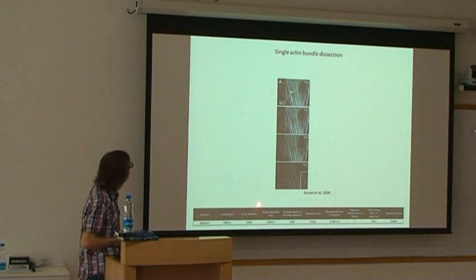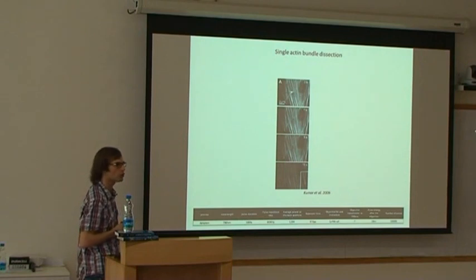And this, all the other. Then the numerical aperture of the objectives, as you can see here, is 1.4. So it's a good objective to do this kind of laser-tissue interaction. So the ablation happens where the arrow is pointing. And you will see there's a fiber, and then you see a hole, which is in fact expanding.